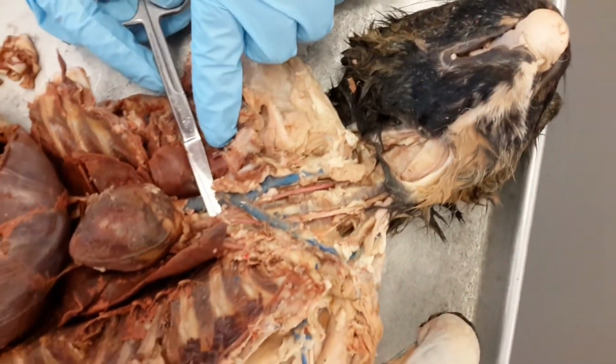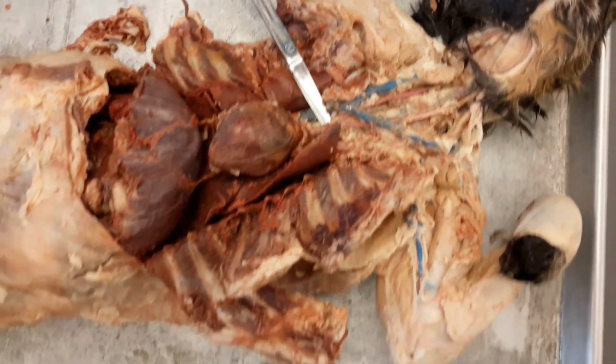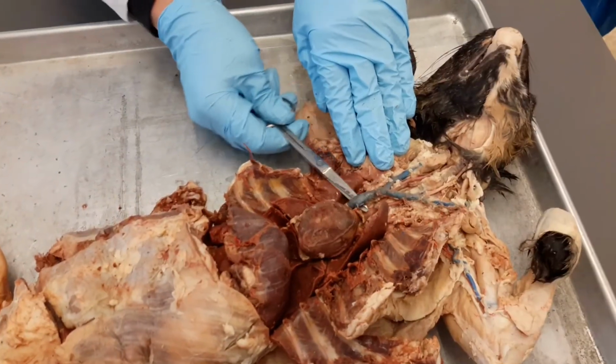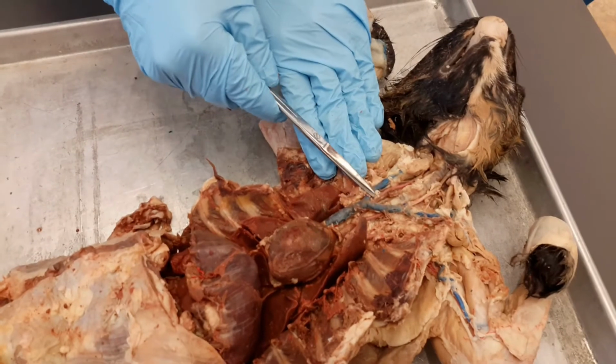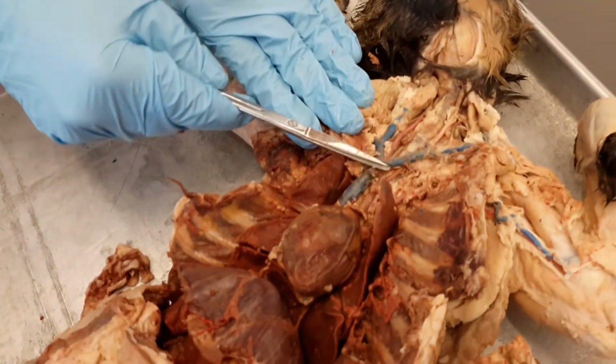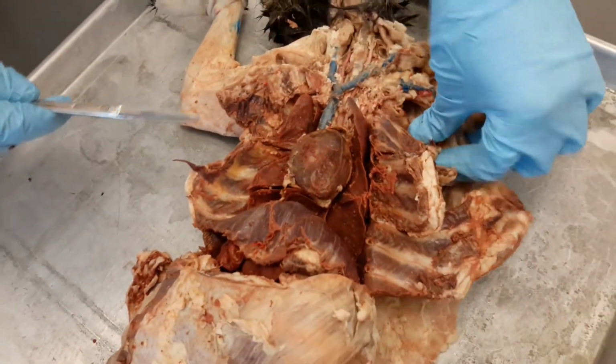So it fills the vessels and all the veins turn blue and all the arteries turn a pinkish color, right? The veins are going to be easier to see because we already know from lecture. Tell me about the diameter of veins. Big, right? Okay. So the superior vena cava splits off into a right and left brachiocephalic vein. You can follow this out to one side. You don't have to do both sides, right?